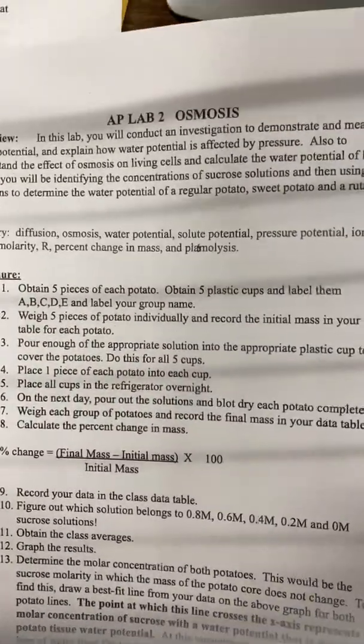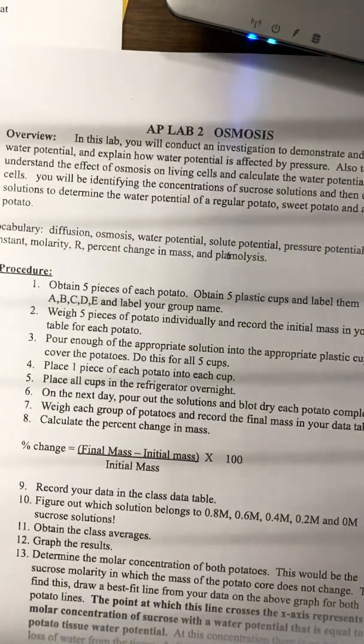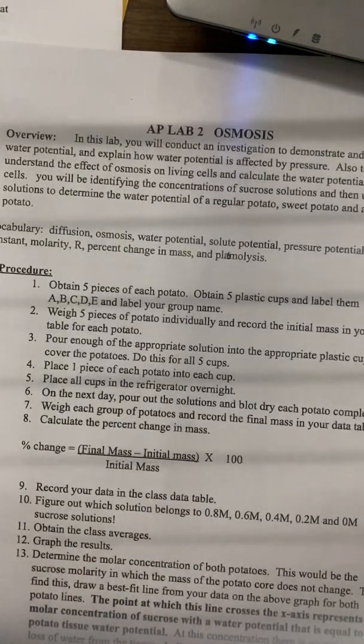Okay, your picture just needs to show the 5 cups with the pieces of potato in there. We're only going to use 5 cups, which means each potato type will go into each cup. So each cup will have a piece of sweet potato, rutabaga, and Idaho in there, and we will cut them in different shapes so you will know which potato is which.